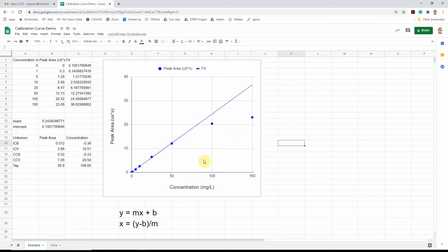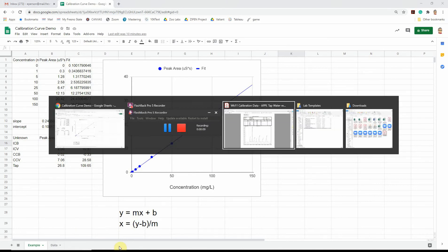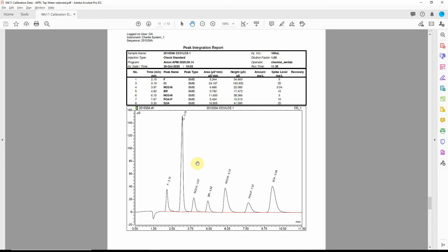This video is going to be a quick one through of how to generate a calibration curve in Google Sheets. So the basic issue or challenge we're dealing with here is that we have lots of techniques for measuring concentration or amounts of an analyte of a chemical in a solution or in a sample.